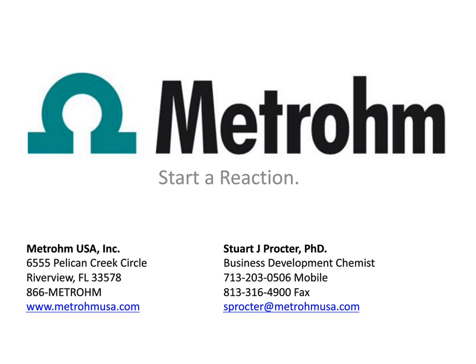However, this is a really good question because I was just at IUPAC last week, and this was a big discussion as to how small of a sample can you take from, say, for instance, a crop or a fruit or vegetable and still have a representative sample. In general, yes, of course we would like to work at smaller sample sizes. Why not? It's easier to handle. The logistics is minimized. The cost is minimized.